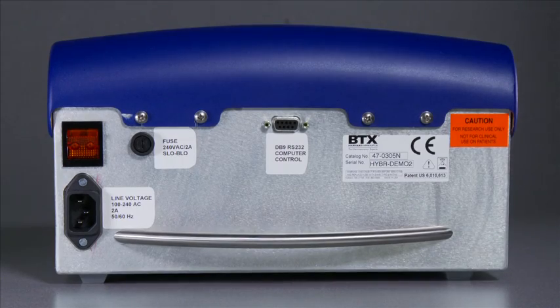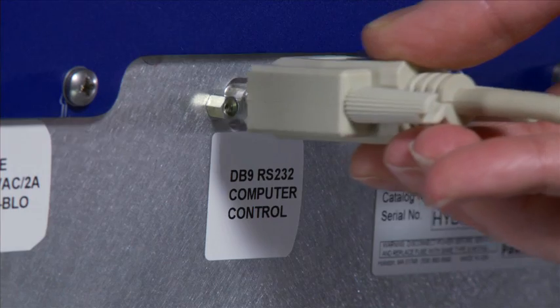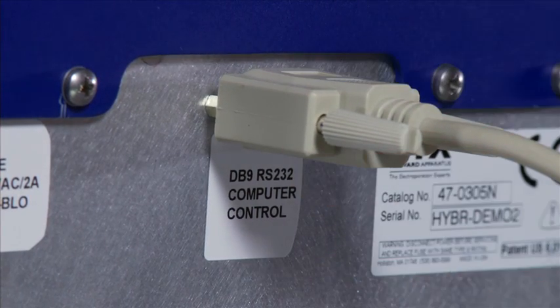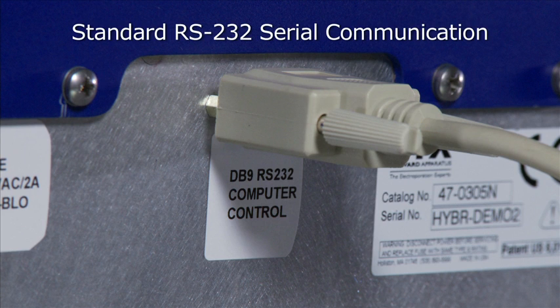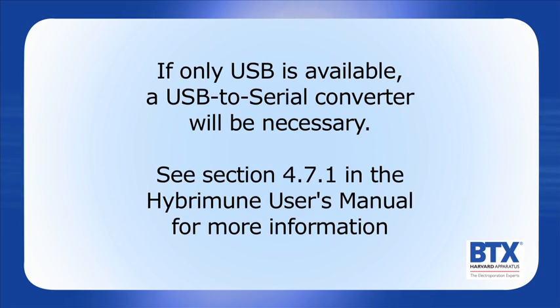Next, connect the serial cable between the D-subminiature 9-position DB9 connector labeled Computer Control on the back of the unit, and a serial port on the computer. This is the communication link between the microprocessor within the waveform generator and the computer. It is a standard RS-232 serial communication. If only USB ports are available on the computer, then a USB-to-serial converter will be necessary. See Section 4.7.1 in the HYBRAMUN user's manual for more information.